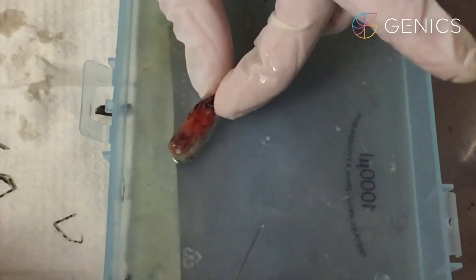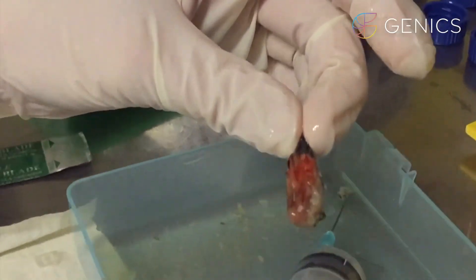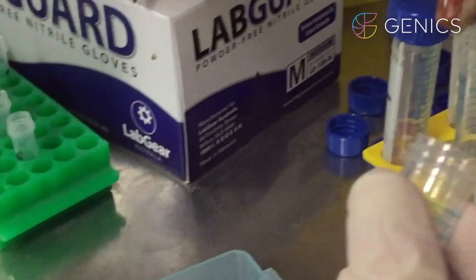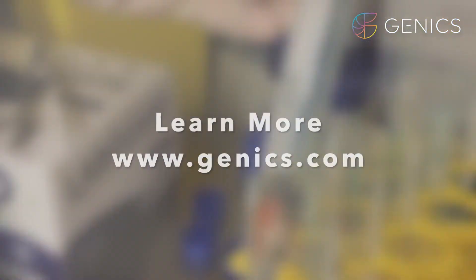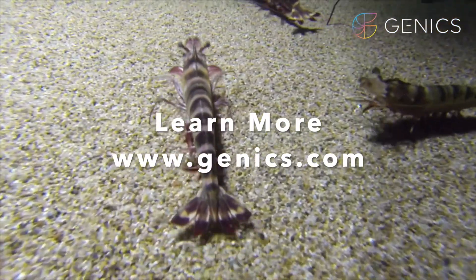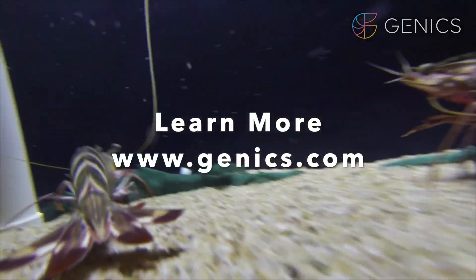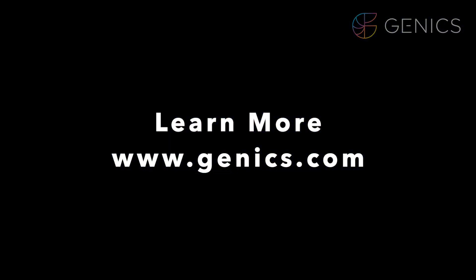Once fixed, this piece of the shrimp head is then put into a tube with Davidson's solution, where it's left for 24 hours before being transferred into 70% ethanol. Once it is in 70% ethanol, the head will then be trimmed and blocked for deep-dive histopathology.